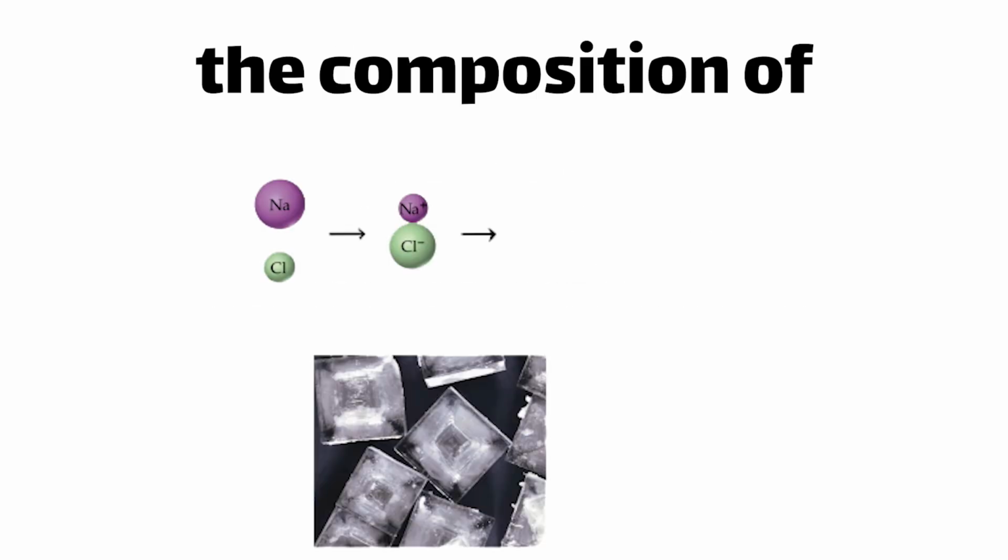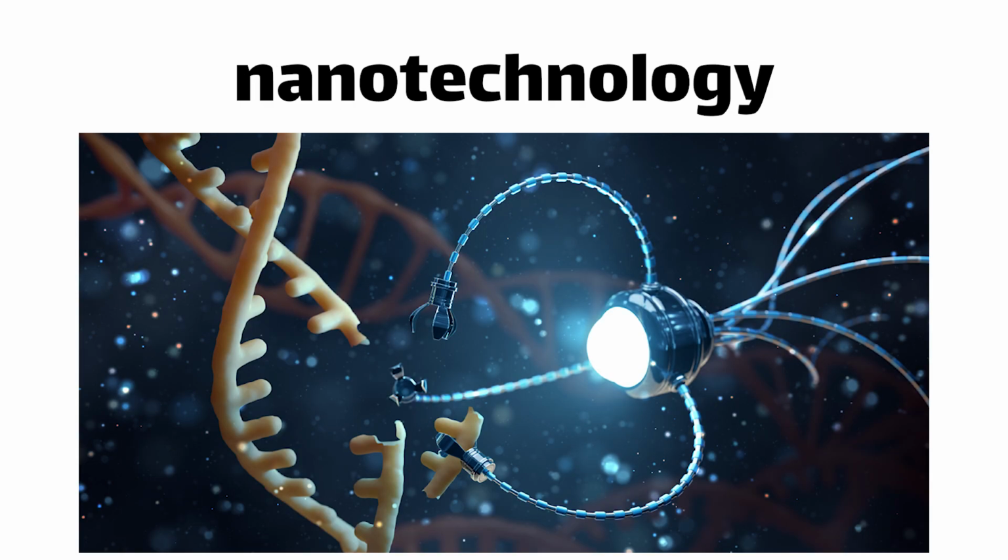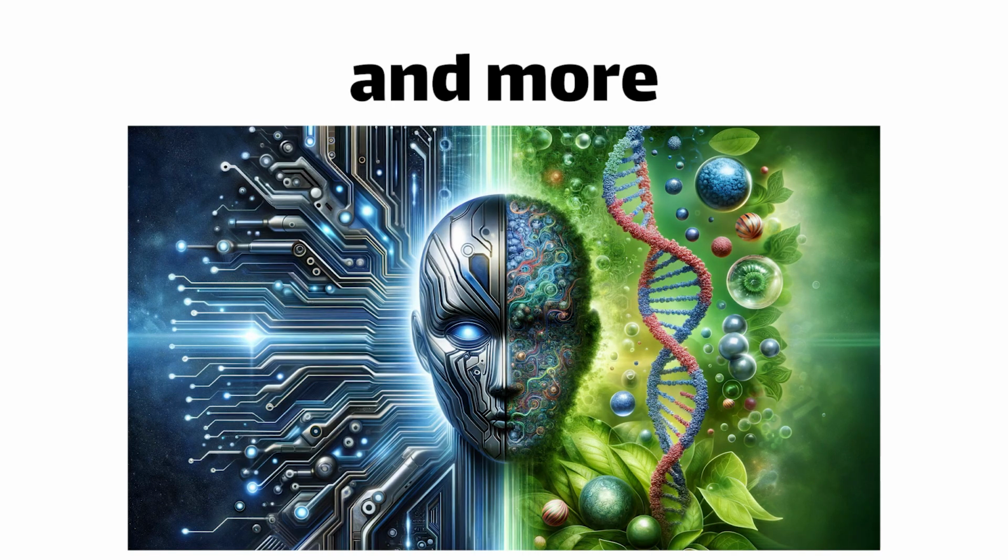By combining with spectroscopic techniques, TEMs can also map out the composition of elements within samples. This ultrastructural and analytical data is invaluable for fields like material science, nanotechnology, biology, and more.